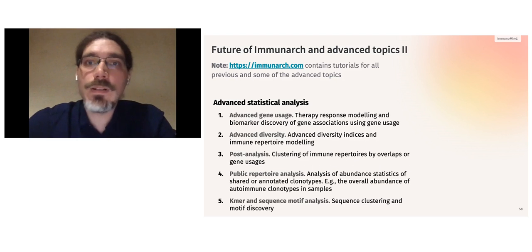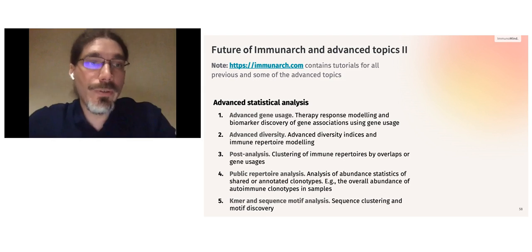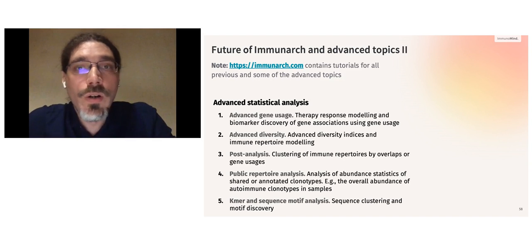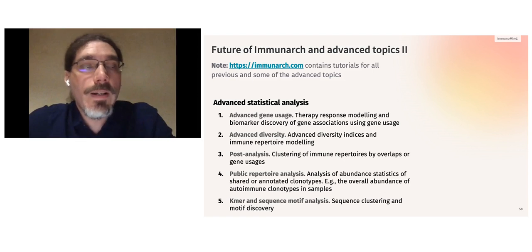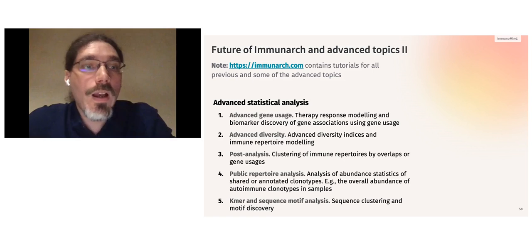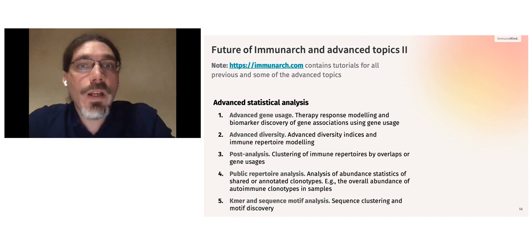The second cluster of topics I would like to discuss is the advanced statistical analysis. So first of all, it's possible to do advanced gene usage when you apply linear models to gene segments and identify specific gene segments linked to a therapy response or something like that. There are some advanced diversity indices I already mentioned before.